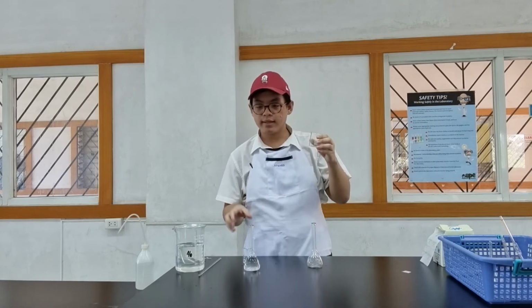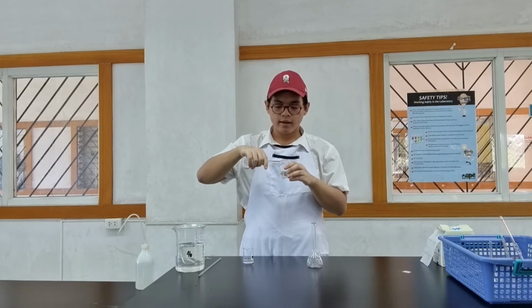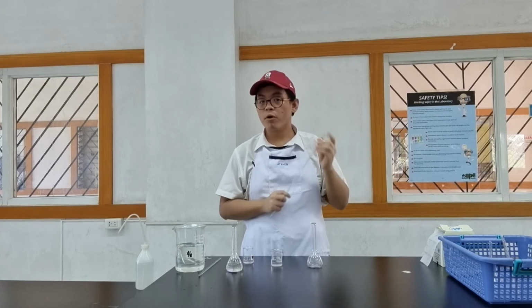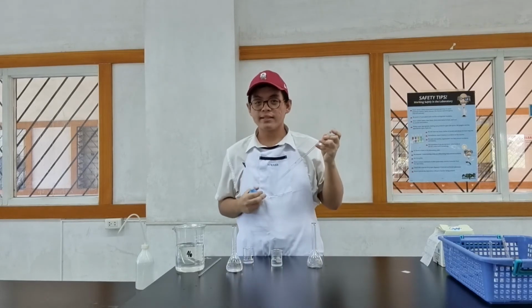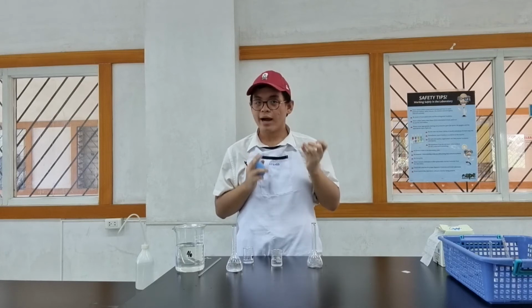Because I've now rinsed this, I can now confidently put in my solution. I don't need a lot. A volumetric pipette is more accurate than an ordinary pipette. So I'm going to use a volumetric pipette. The thing about pipettes, however, is that you also need to rinse inside the pipette. So how do we do that?